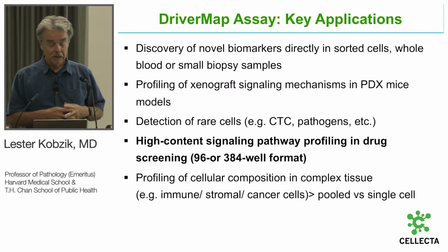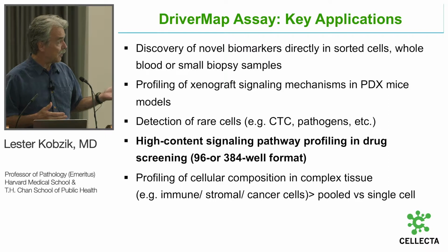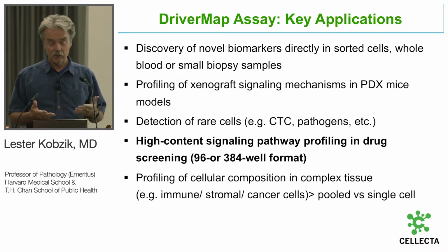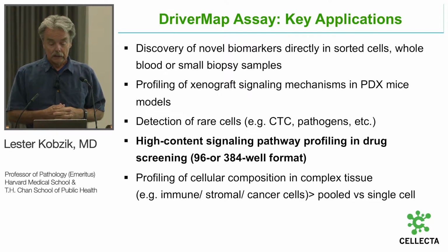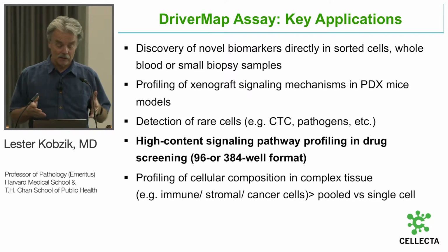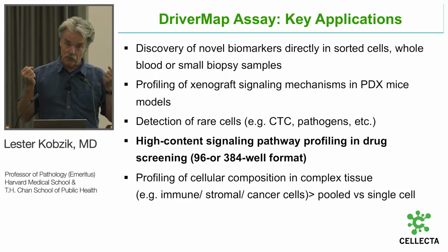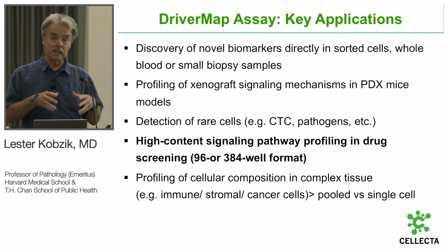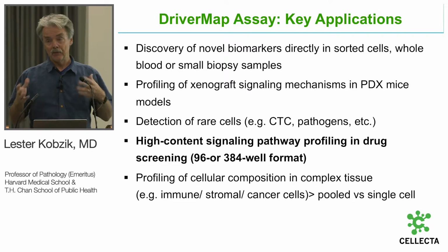Okay, and he mentioned a number of the applications. I just put in bold the one that I'll be sharing with you, which is you can use this technology to profile drug responses and learn something about what's going on. There's plenty of other potential. My favorite one, to tell you the truth, is number 2, which is the idea that you can use this human-based platform to study human tissues in PDX or other xenograft models without having to worry about the mouse background.